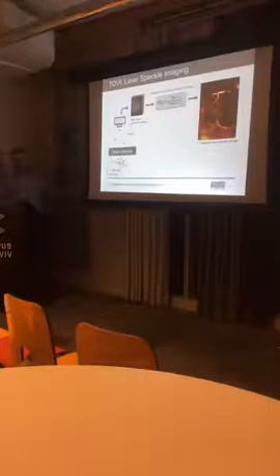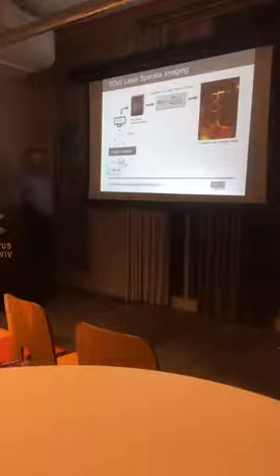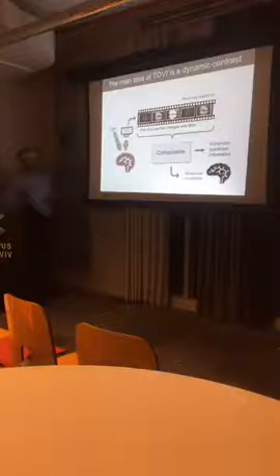You can write this code in ImageJ, LabVIEW, or any programming language, and we can get this image. Very simple mathematics. Okay, this is speckles. Fluorescence again: we illuminate the brain, collect the images, the changes over time, and we can analyze them. We use computation to enhance and recover the images. I'll show you a little bit more in detail.